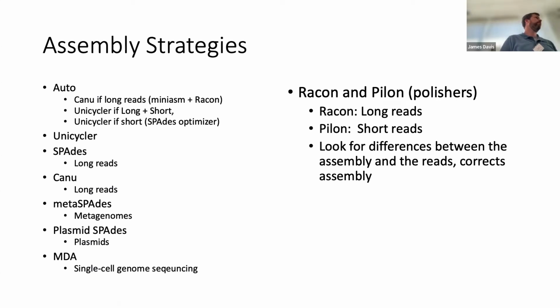Yeah. Okay. Yeah, these recipes have evolved over the last 4 or 5 years. Our original auto assembler was just SPAdes at one time. These do periodically get updated. Right now, nanopore reads, which are coming on strong, the system doesn't do as good a job as Flye does. When you annotate one of the sets of reads with our system, it gives you 150 contigs. Flye got it down to 1.